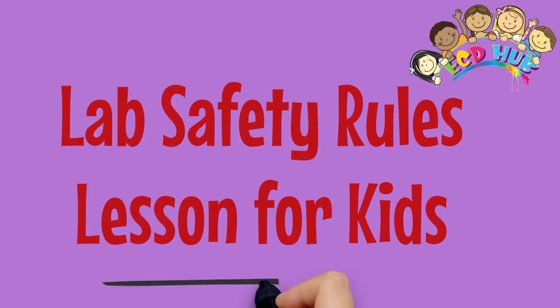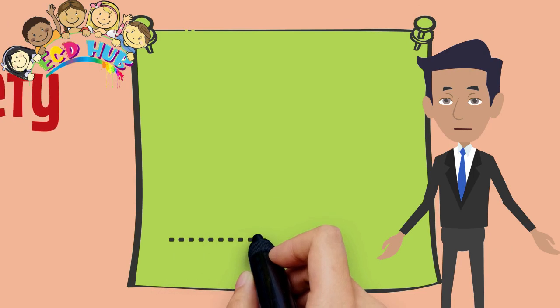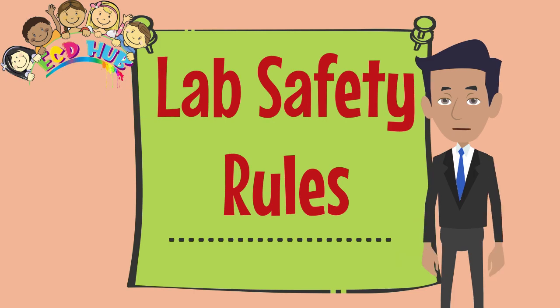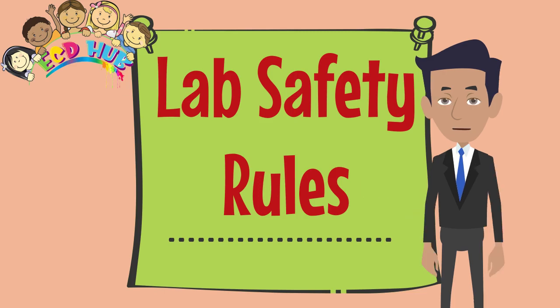Lab Safety Rules, Lesson for Kids. Sometimes children are asking, why are lab safety rules important? The answer is the same. Proper lab safety prevents cross-contamination. Disease and bacteria are spread when lab procedures are not followed.